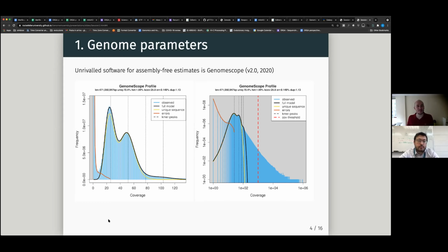Okay. Normally, these kind of plots are actually a bit scary, if you're not used to it, or if no one explains how to read such a plot, but it's one of the most powerful tools in the genome assembly community. It was developed by Mike Schatz's lab, GenomeScope 1 a while ago now, and GenomeScope 2, which you may have run already, right? It's actually extending their range of applications to polyploid organisms as well, so not just to diploid and haploid.